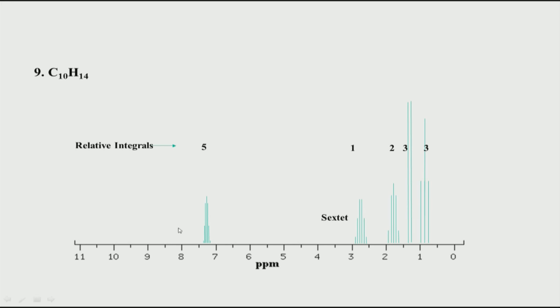Another way is from NMR; you can look at this spectrum here. You will get a somewhat complicated peak pattern somewhere between 7 to 8 ppm. Remember, we saw that this belongs to aromatic groups, but you may also get amides here. But here we do not see any nitrogen or oxygen, so there is no amide possibility. So typically if you see a bunch of peaks clustering around 7 to 8 ppm, it immediately signifies the presence of an aromatic ring.